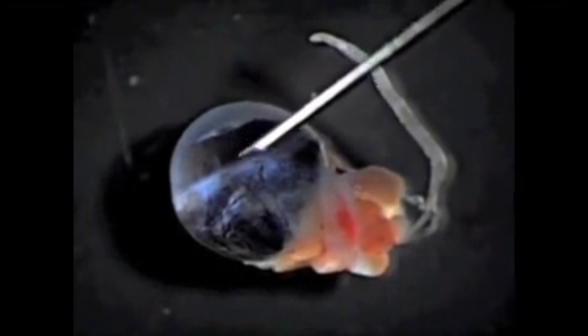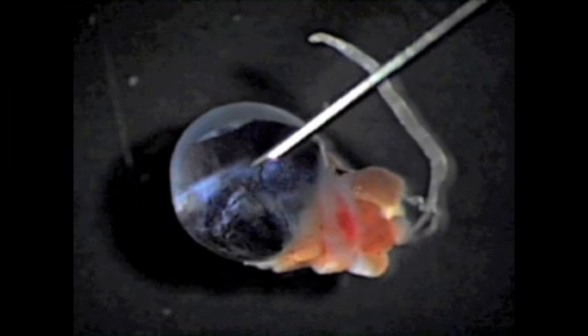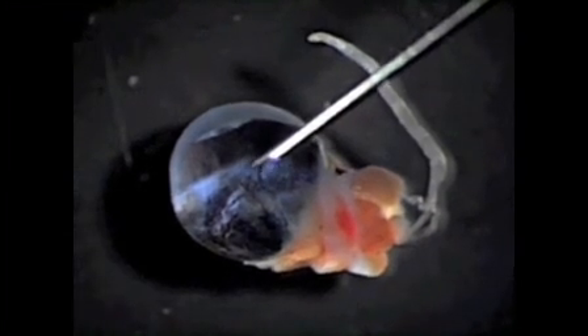The most important surgical landmark is this white line, or the limbus. We will be making a puncture wound just behind it.